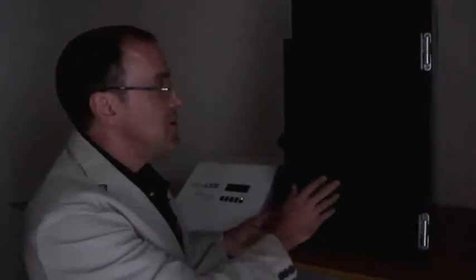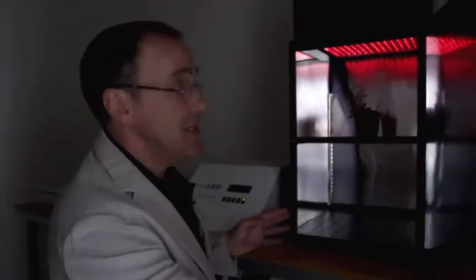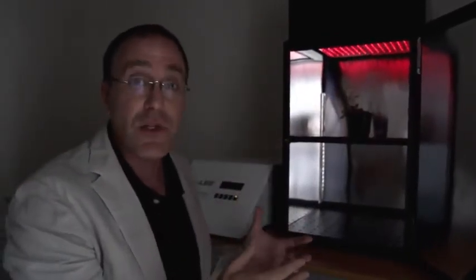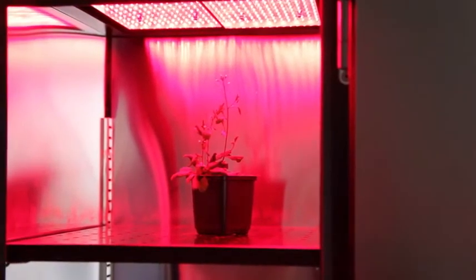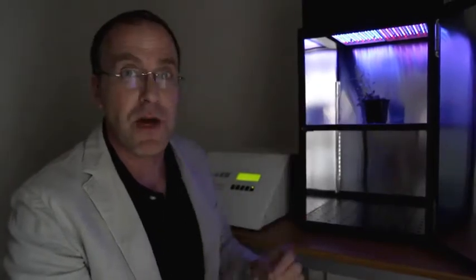All right, so what we have here in this special chamber are lights of different wavelengths, LEDs. And here we can see one Arabidopsis plant that's been growing under far red light. And these are LEDs that are very high intensity, but it's about 720 nanometers. That's why you don't see it so bright, because it's sort of at the end of our visual spectrum. But with one push of a button, I could turn that now into turning on the blue lights. And now we could see what would be the difference, how this plant would respond in blue light.